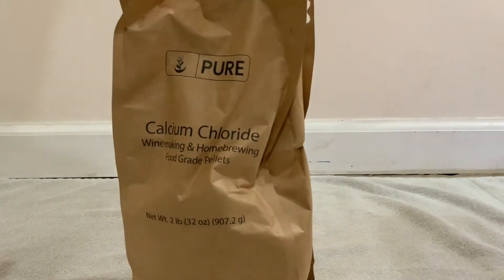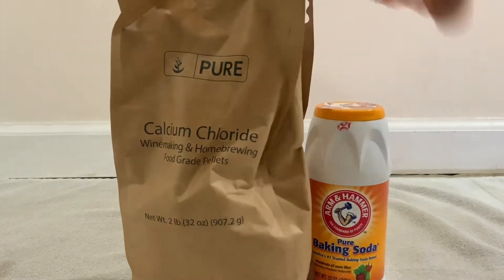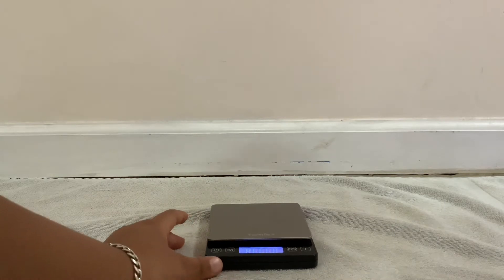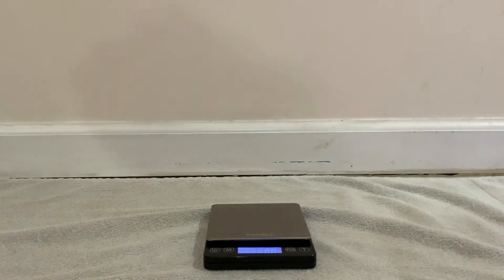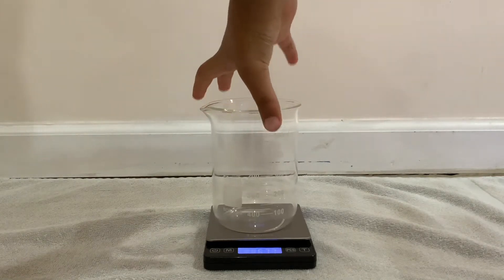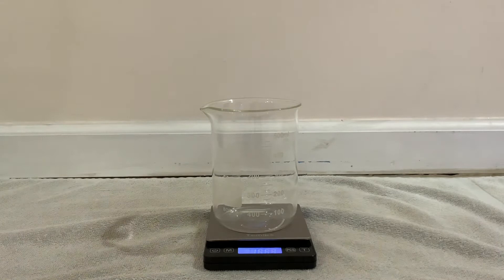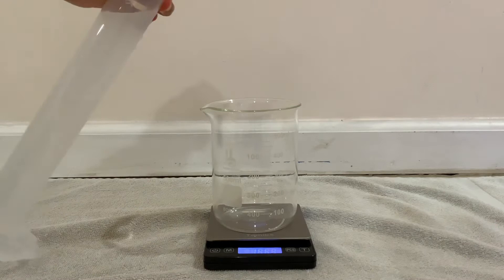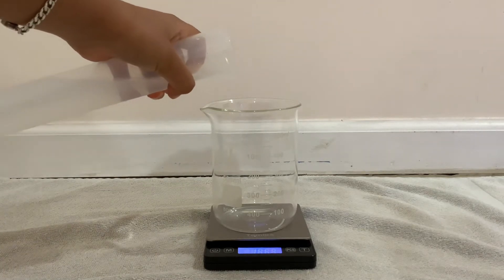So all we would need is calcium chloride and baking soda. First, I've got it on my scale. I turned it on. I place my new beaker on the scale. And now I measured out 12.3. I'm just going to put some water in, so I put 100 milliliters of water.